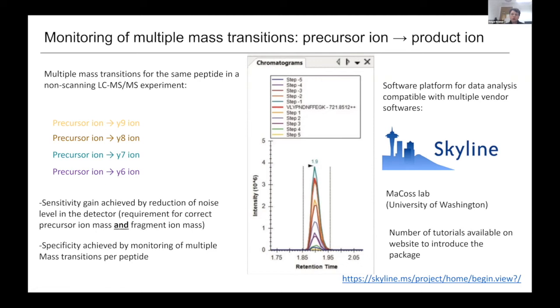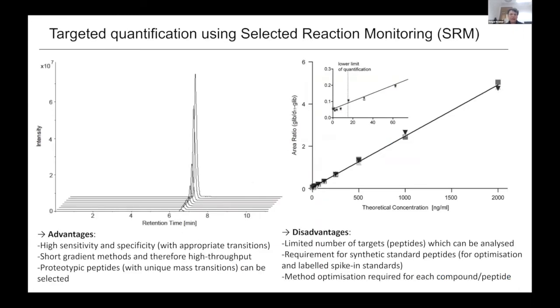Because this is not a discovery proteomics approach, it has been proposed as a follow-up experiment to discovery proteomics experiments, where we may have a large set of samples that we need to analyze, and where we want to be able to quantify without any missing values across the entire set with maximal sensitivity. Here is shown an example of targeted analysis of, in this case, a small molecule.